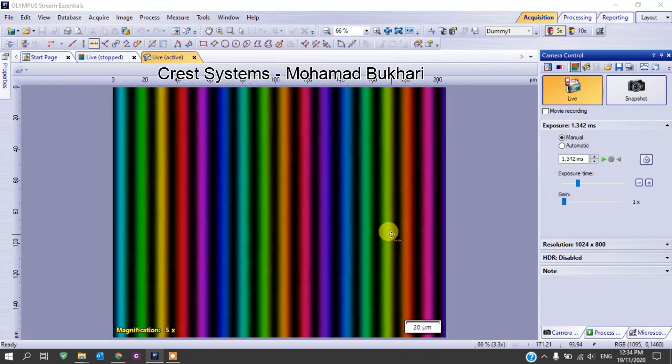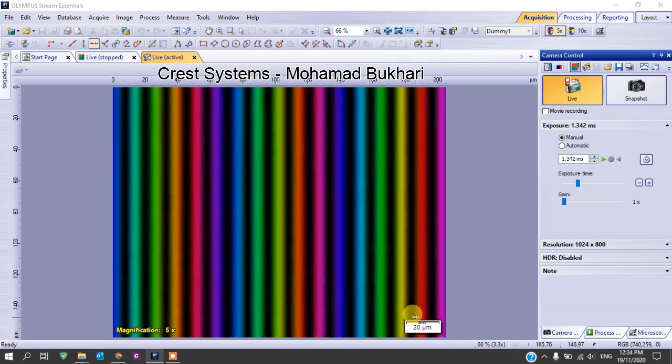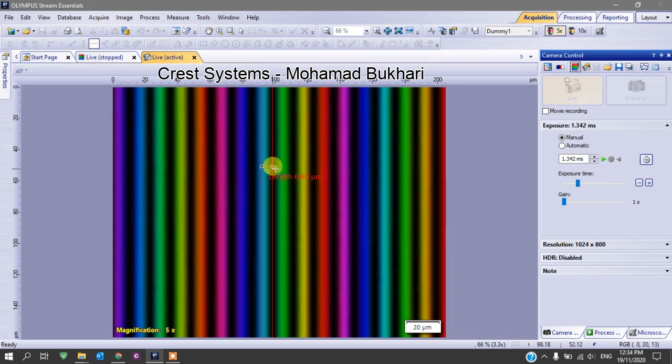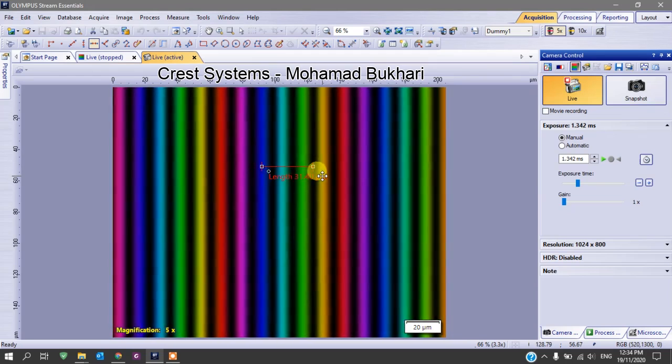Today I want to teach you how to change the calibration unit. Now you can see the calibration unit is Micron, here and here in Micron. During the calibration you can see here is Micron. And then how I want to change this one to mil.